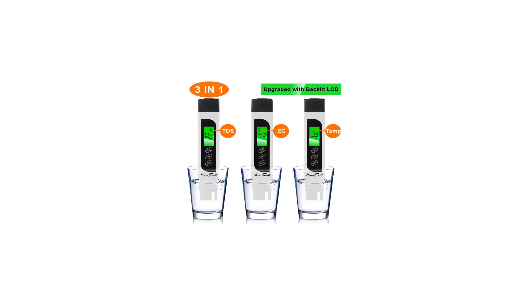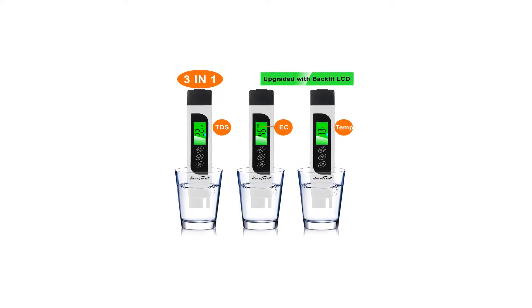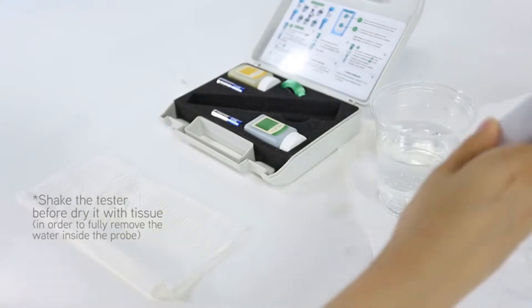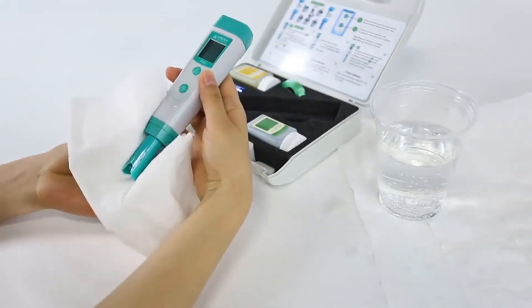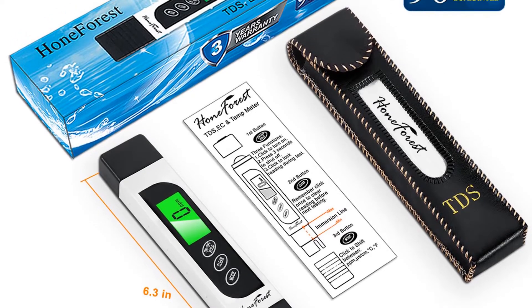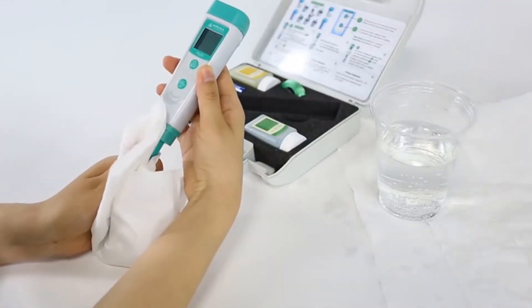This TDS meter is extremely affordable and offers a quick 60-second test to ensure your water is safe, especially if you've been storing it. The green backlit screen is easy to read and the pocket size is highly portable. If you want to ensure your drinking water is safe and does not require measuring specific pH, then we recommend this TDS meter.